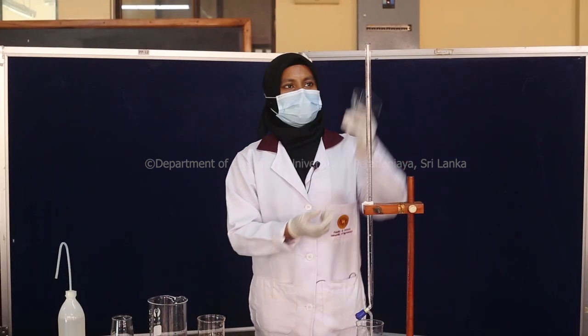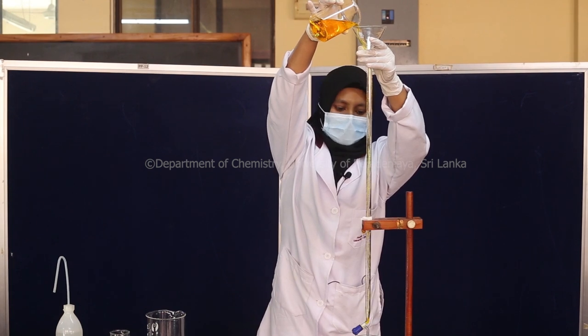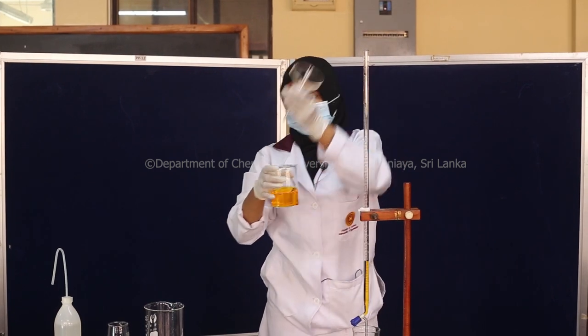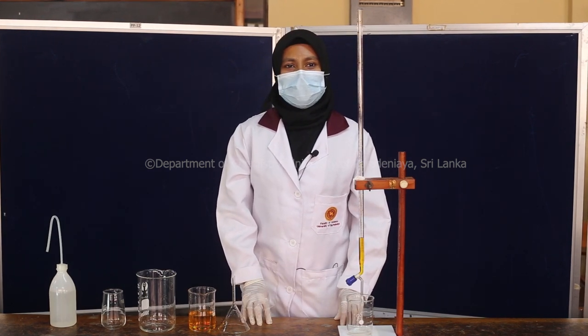Fill the burette with approximately 5 to 10 milliliters of the solution to be used. Then remove the burette from the stand while holding it vertically.